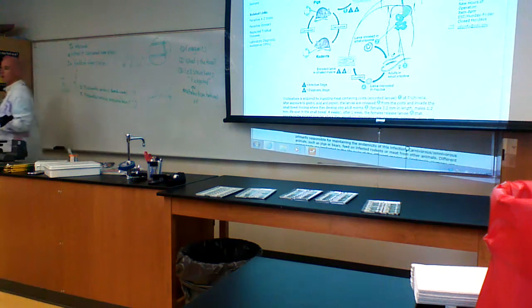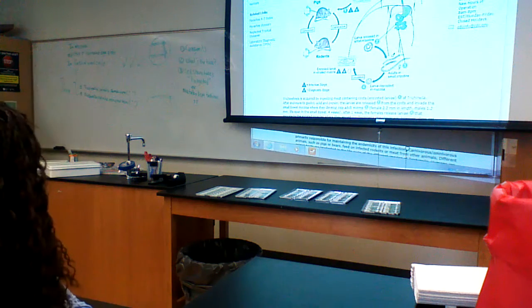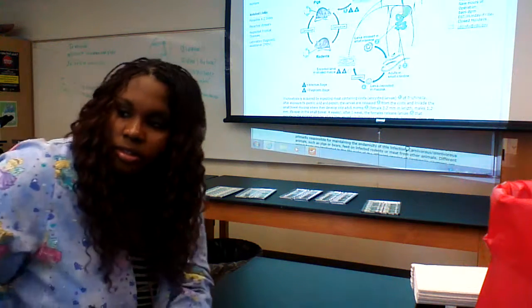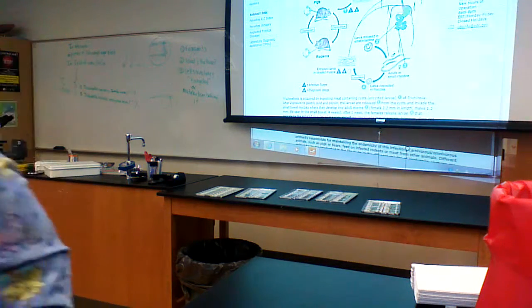So, on the practical, I'm just adding one more parasitic worm. Yep, that's still on there. When you open it up, smell that.